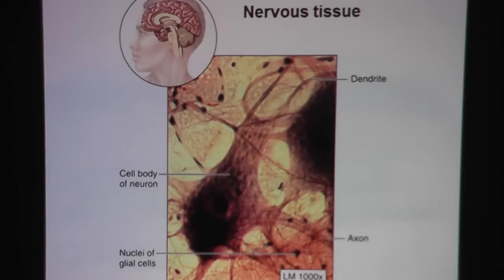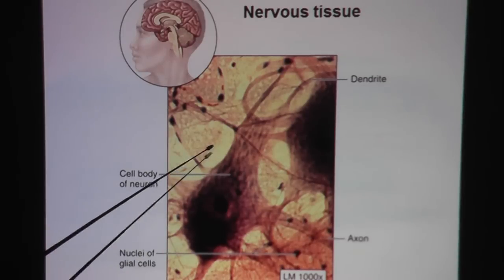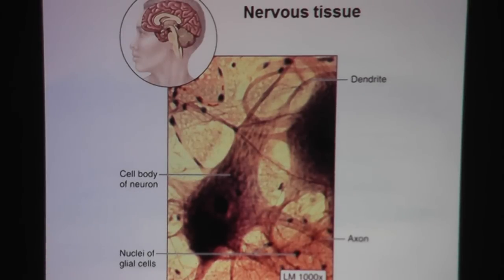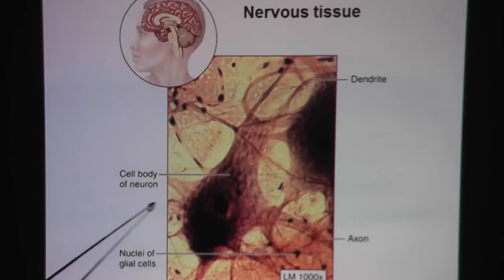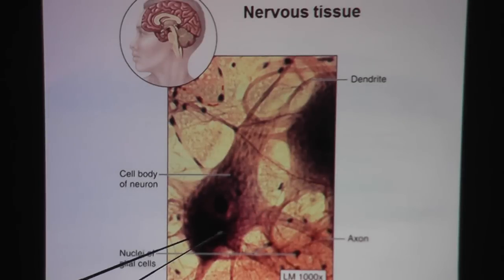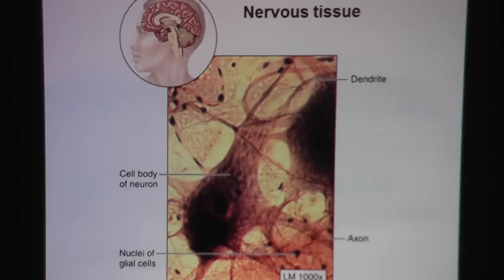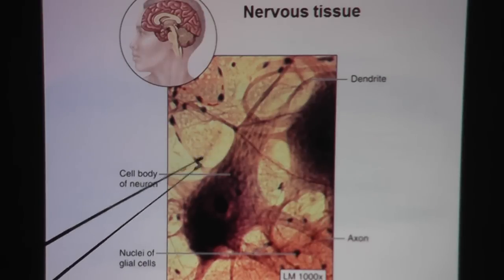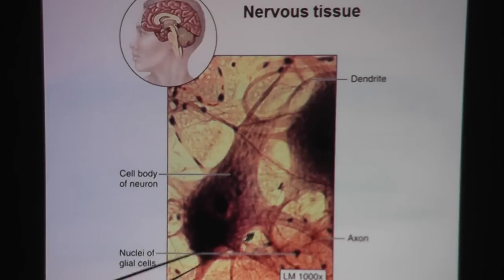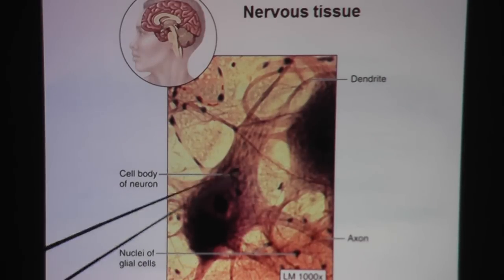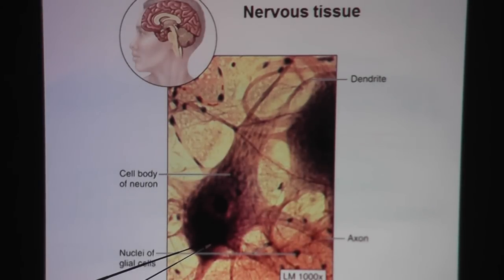Where do we find nervous tissue? Well, in the brain and the spinal cord. There are certain structures you have to be able to identify in the neuron, which is the nerve cell. These neurons have a very distinct look — they are very different than what you're used to. Here is the cell body, the main portion of the neuron.